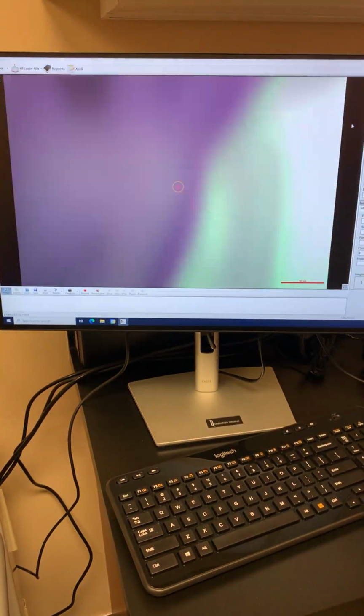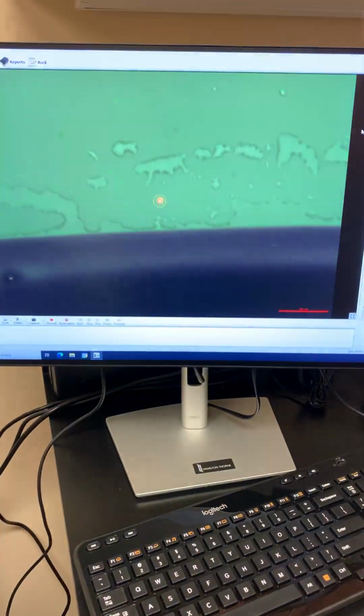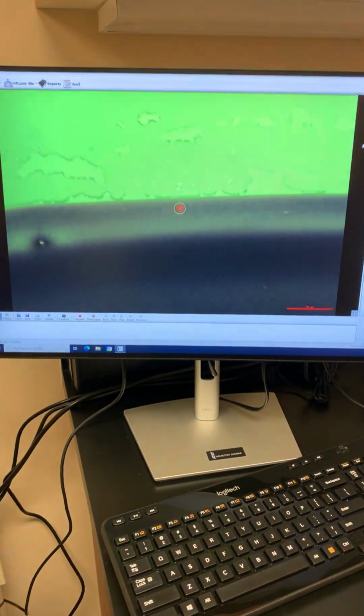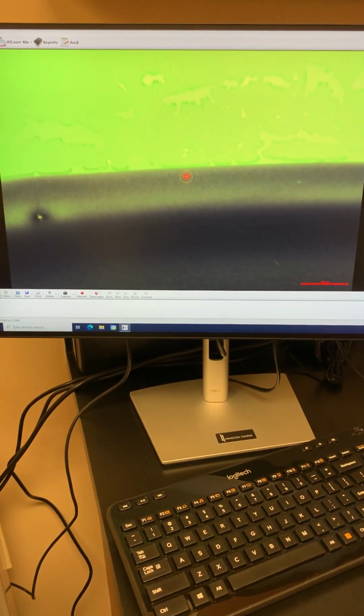Okay. So what I'm trying to do here is I've drawn on a microscope slide with some dry erase marker for the purpose of, I just want to see if this will work to show you guys here. All right, so now I've got to go up to the laser objective, which means I'm going up in magnification here by spinning that.